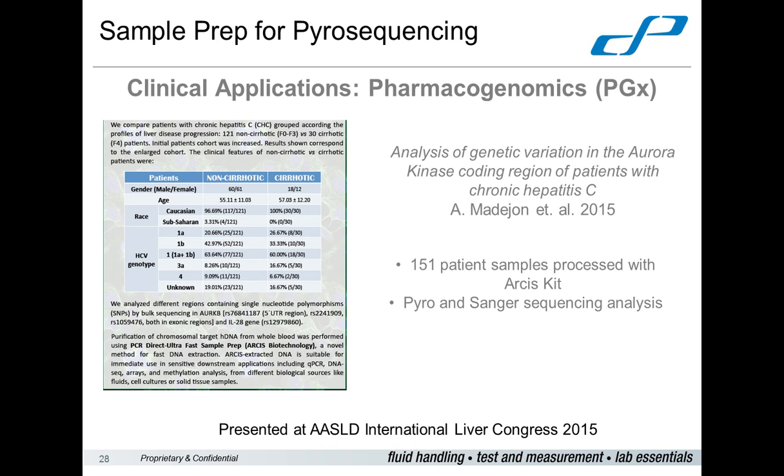So we had a really useful biobank of samples that were ready to be processed, and this was our initial steps into sequencing. So this is Sanger and pyrosequencing data. And we were pleased with the result. We processed a large number of samples very quickly.